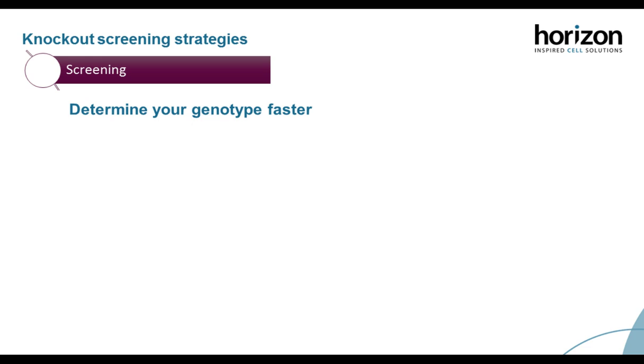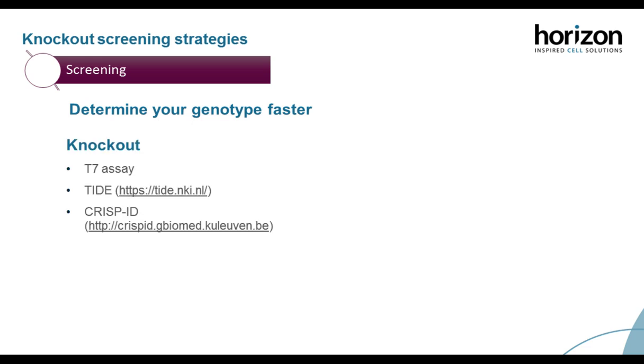The T7 detects mismatched DNA and therefore can identify if that cell has been CRISPR edited. So it can identify if there has been some kind of insertion or deletion in that area. We usually perform these on quite a large scale when we expect a low targeting efficiency in that cell. So if they've had a very low transfection rate, very poor selection, and if the gene is usually quite essential to the cell line, we usually perform these T7 assays.